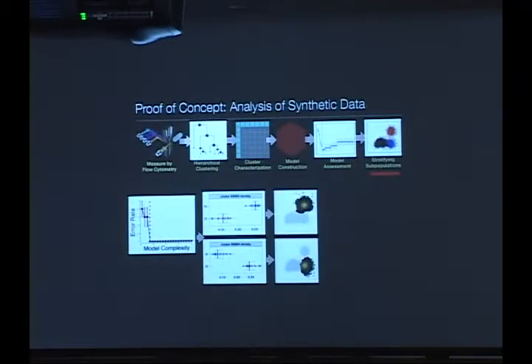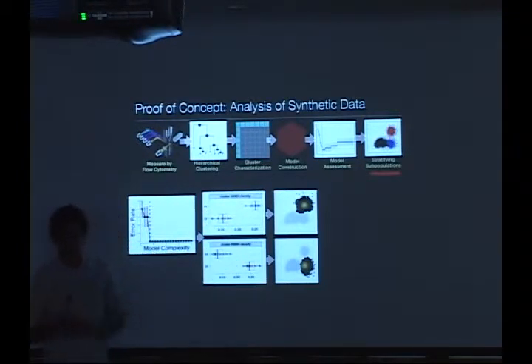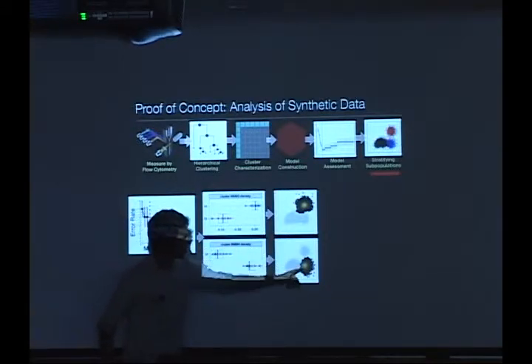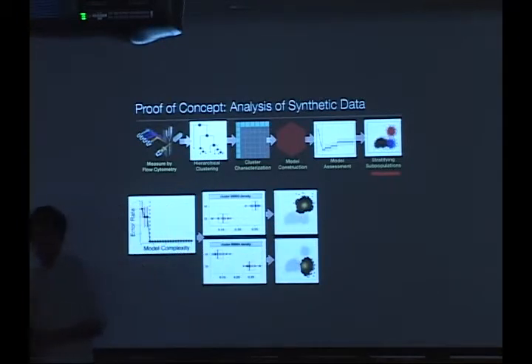And so once we know that this cluster is informative, 99993 and 99994, once we know that those are interesting, then we just use standard scatter plots or density plots to figure out what that cluster is. So we plot the markers that were used to identify that cluster. And so these are those clusters. This is a plot of cluster 99994. This is a plot of cluster 99993.